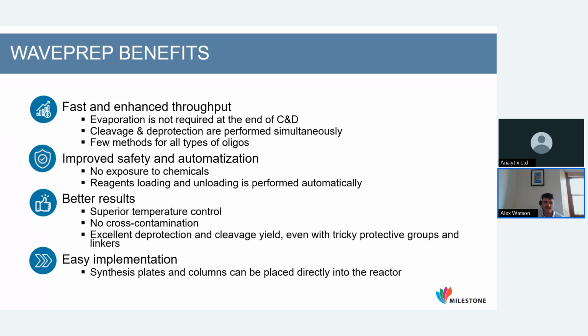Also, it's really easy to implement. Any way in which we get our oligos into that reactor, cleavage and deprotection will work with pretty much the same method.